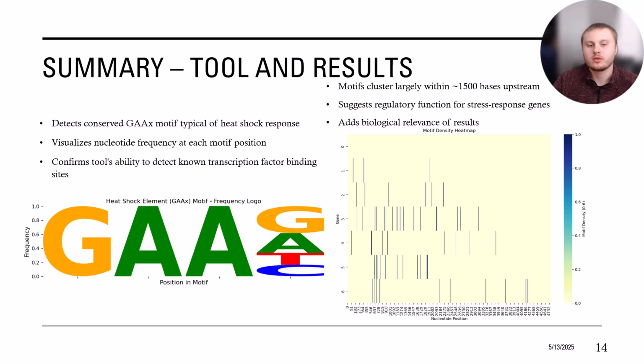So here we're trying to link basically the GimmeMotifs tool and the results that it got. For the results, we just talked about what was happening, but here we're just connecting the tool as well. So all in all, just looking at both of these figures, they're very easy to understand.